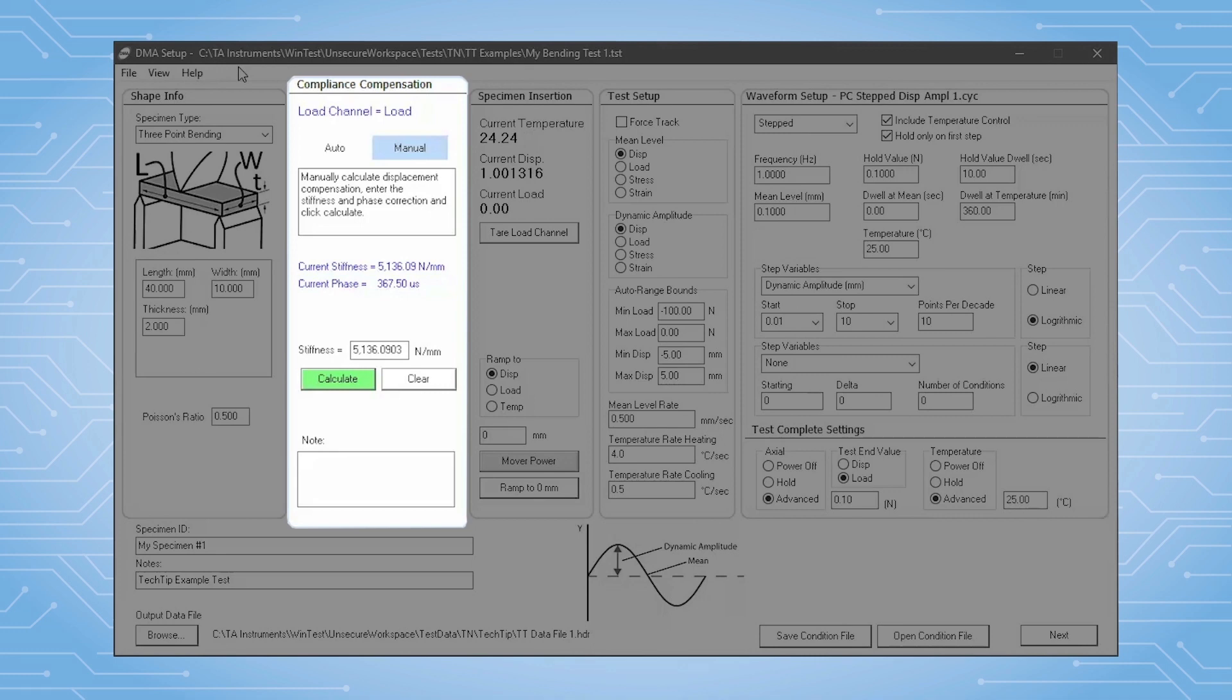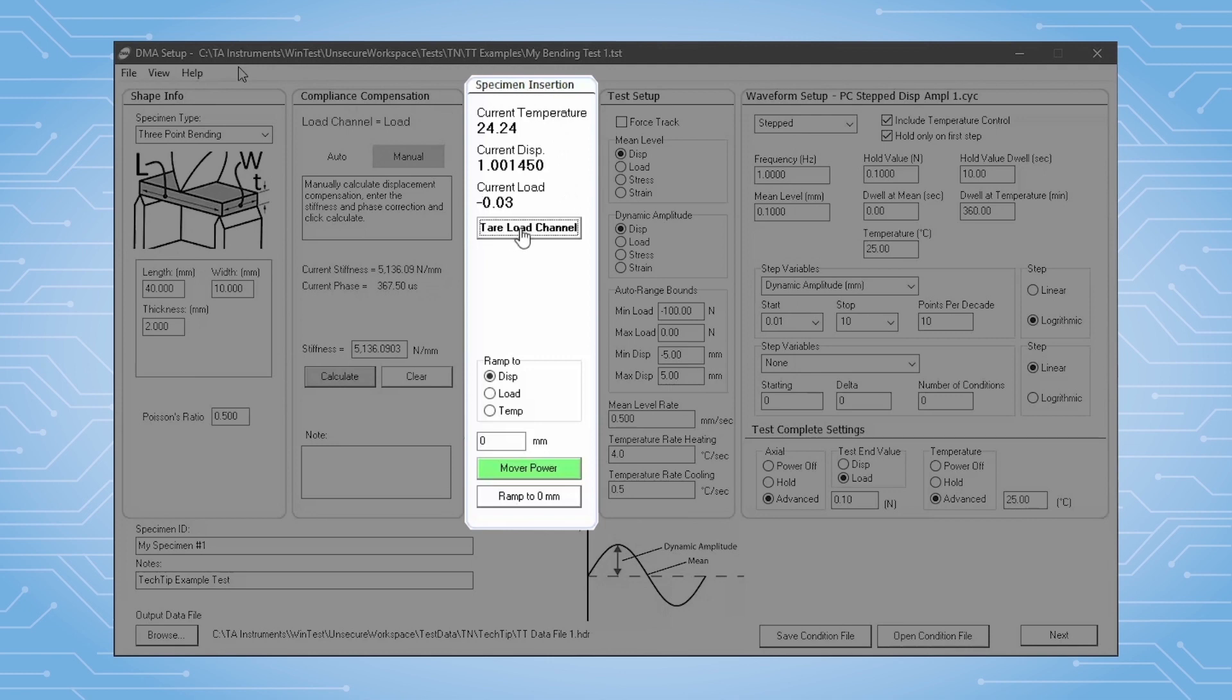The specimen insertion section provides insights and tools that are useful to insert samples. Here we display the primary channels in real time. We also provide tools to position the motor and clamps to a specific displacement.